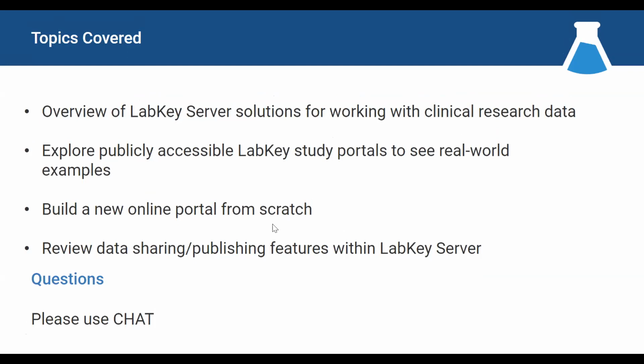We're going to really start from scratch and show you how to put together a portal using the study features. But first, let's get oriented around LabKey Server and its tools and get a sense of what their breadth is and what use cases they're really for.